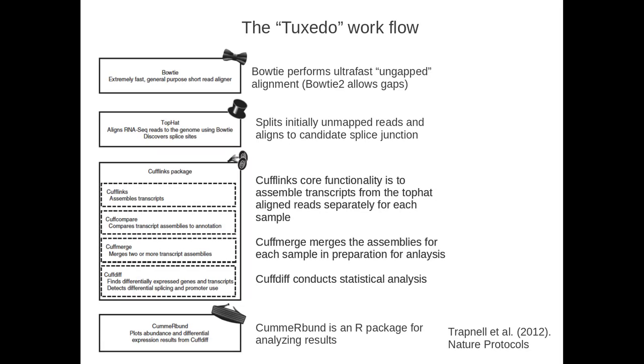These are biological replicates, so separate plants that are being grown in each of two different conditions. And so in the analysis that you'll be conducting for your homework, there are a total of 4 RNA-seq FASTQs, which represent these 4 samples taken from each of 2 different experimental treatments. And the question that we're trying to answer is which genes in the genome are differentially expressed in these 2 different treatment conditions.